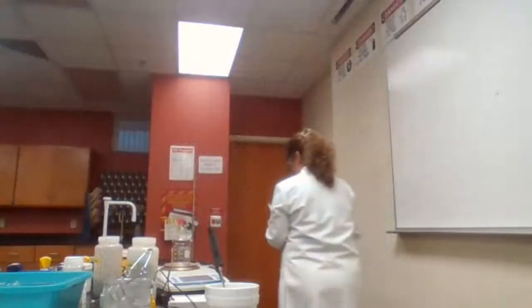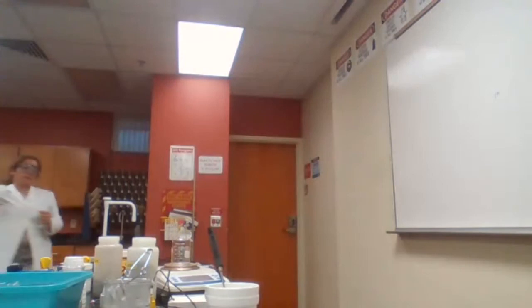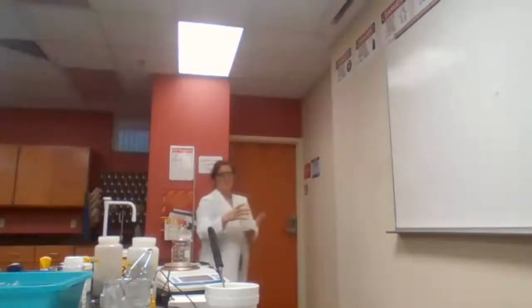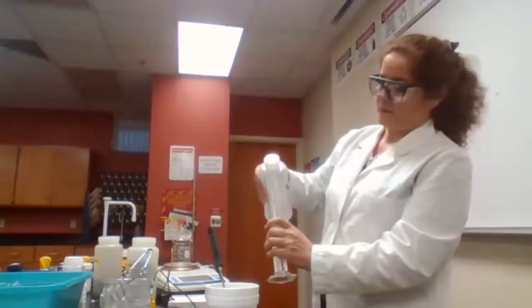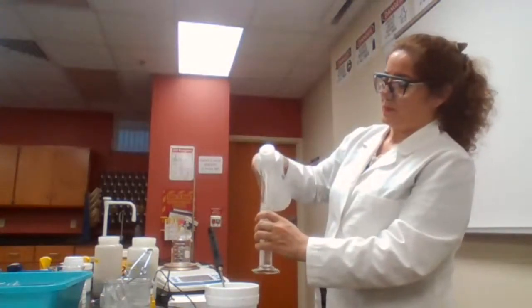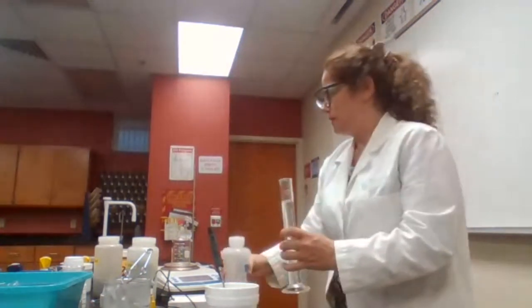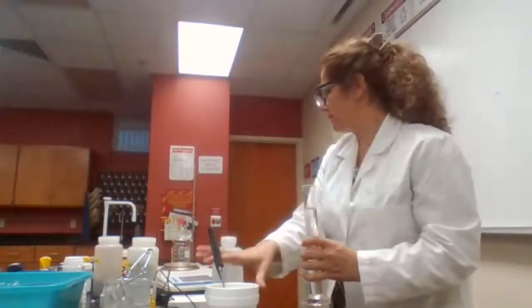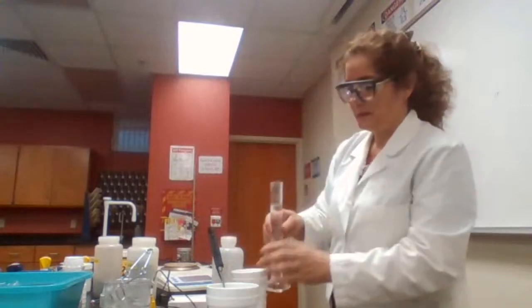So we get 100 ml of water in a styrofoam cup, and we place the styrofoam cup in the beaker again.